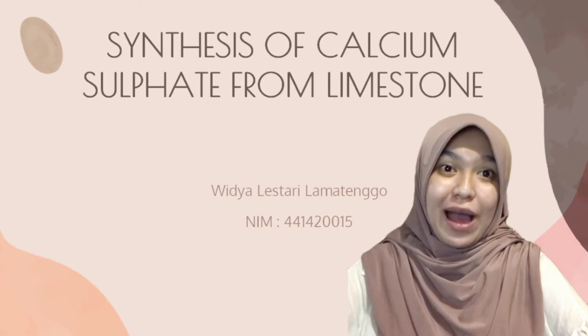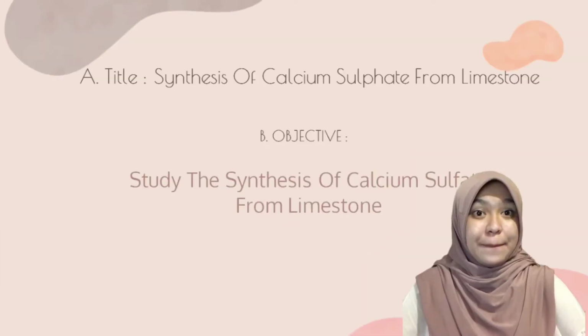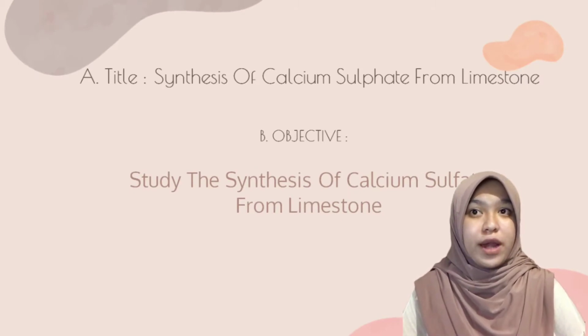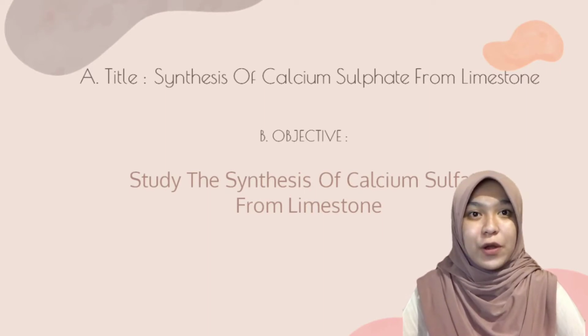In this video, I will explain inorganic chemistry practicum. The practicum title is Synthesis of Calcium Sulfate from Limestone. The objective is to study the synthesis of calcium sulfate from limestone.